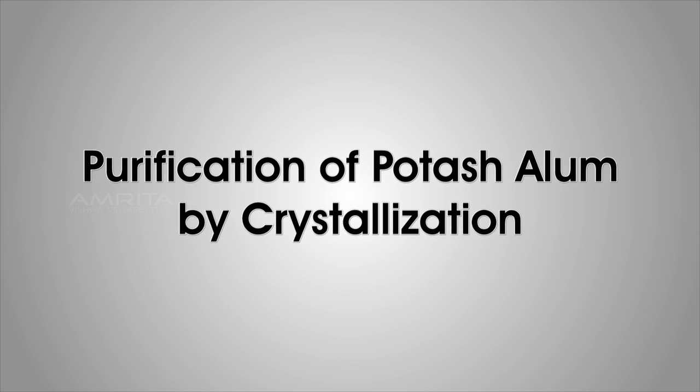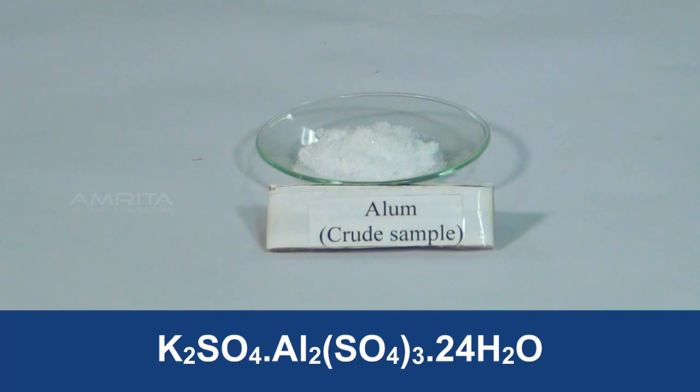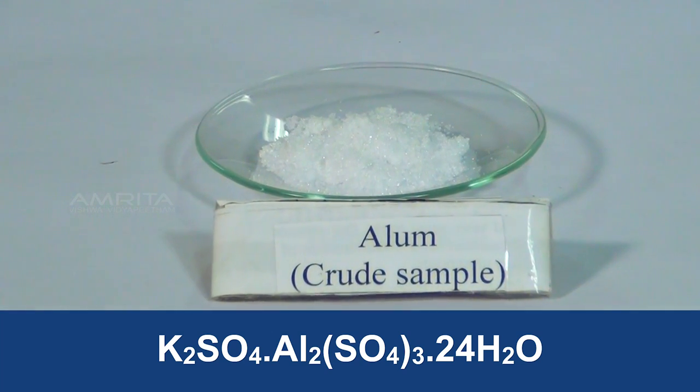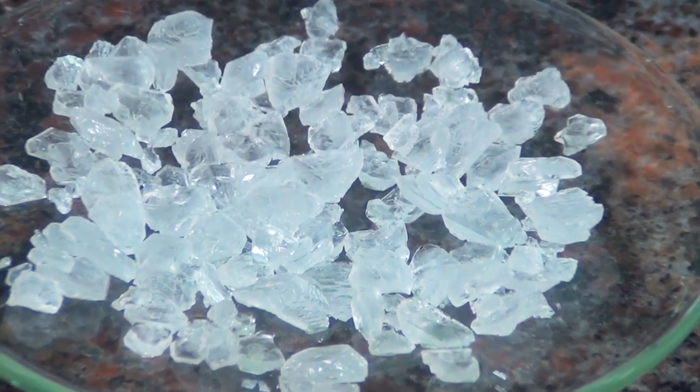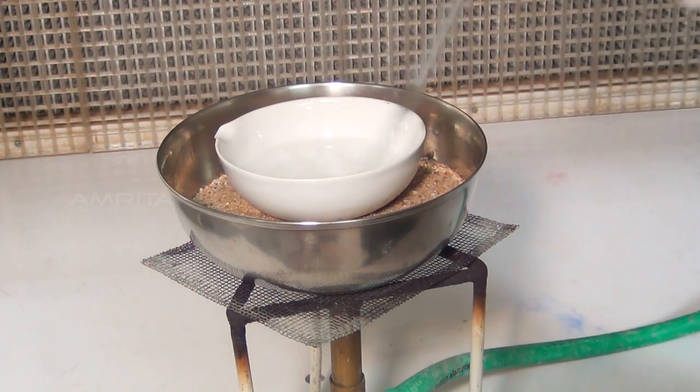Purification of Potash Alum by Crystallization. Potash alum is a double salt of potassium sulphate and aluminium sulphate. We can make pure crystals of Potash Alum by the process called crystallization.